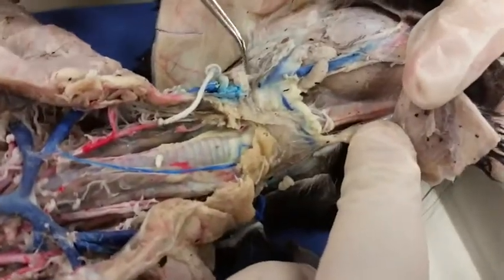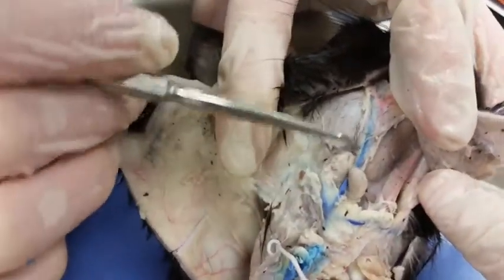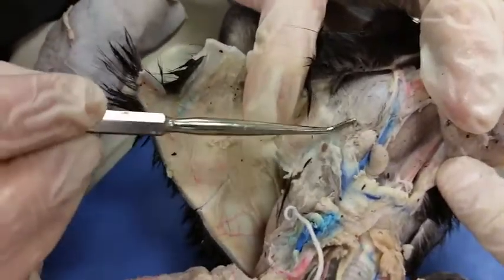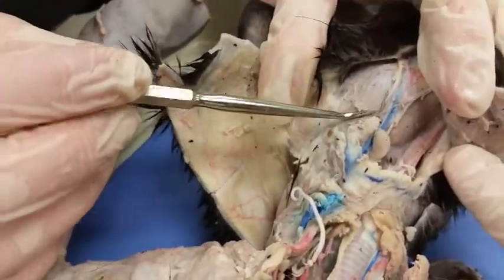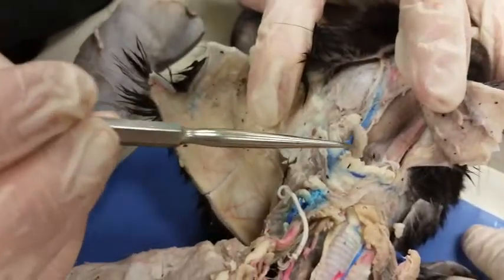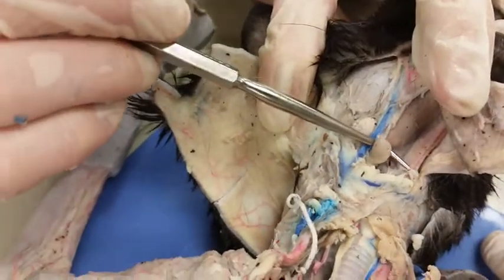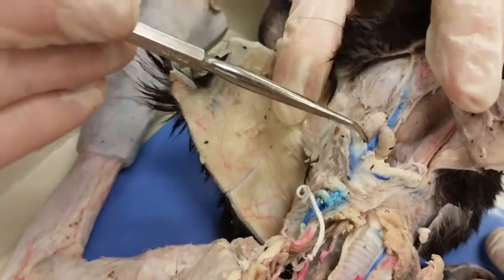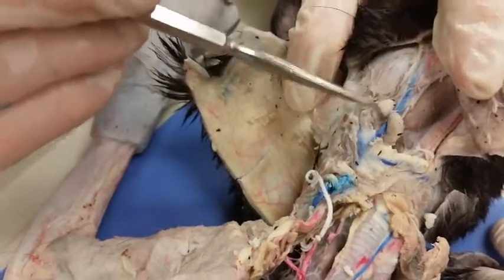So for orientation within the face of Halle Berry, this is the jugular vein. Don't need to know that for the face, but this is the jugular vein. And then right over here is going to be the mandibular gland. And then right here, this little thingy, that is the sublingual gland. Because they do go through. And then there's also a lymph node right here. So the sublingual gland and the lymph node look very, very similar here, but they're not.